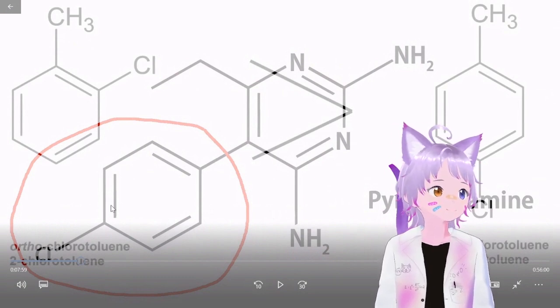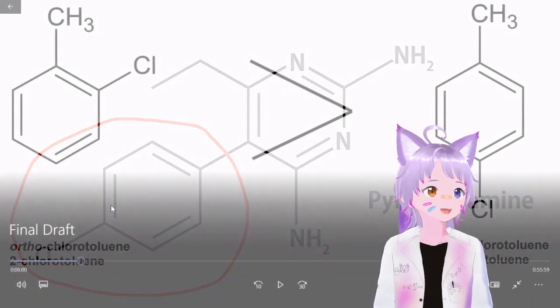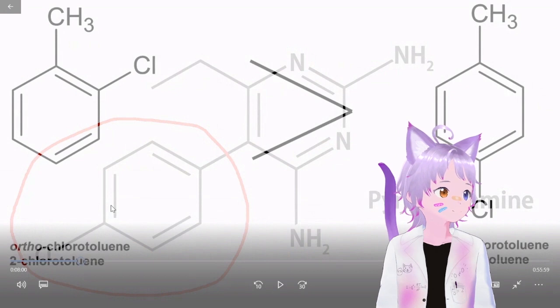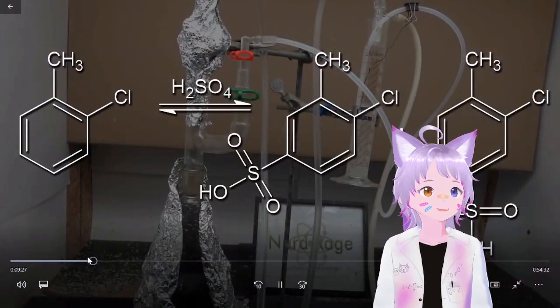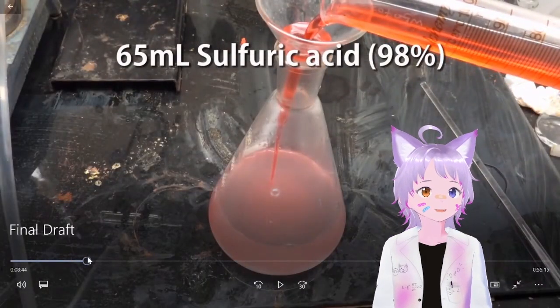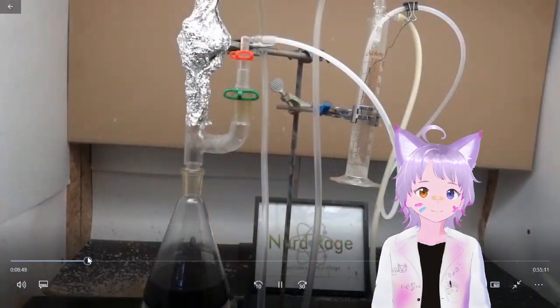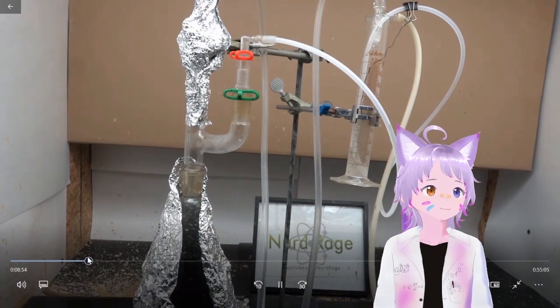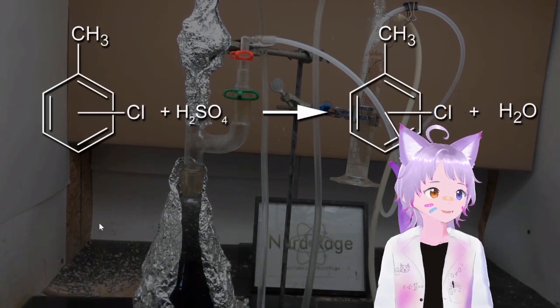And an addition funnel, drip it in, maybe at an almost equal rate to your water removal, and it would probably work. Maybe he tried that too. Did he? Okay, so it didn't cross his mind, because that's what we're going to do when we review it. Now he just drops it in. We're not going to just drop everything in, because obviously the yield is going to be bad.